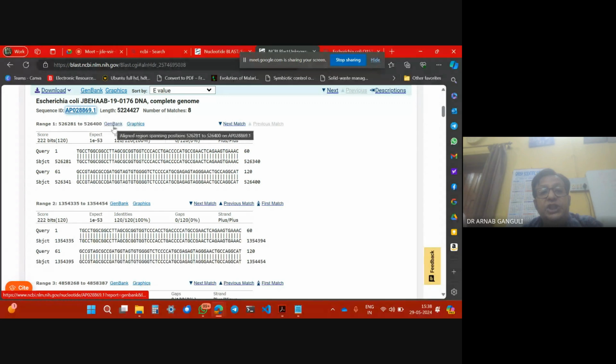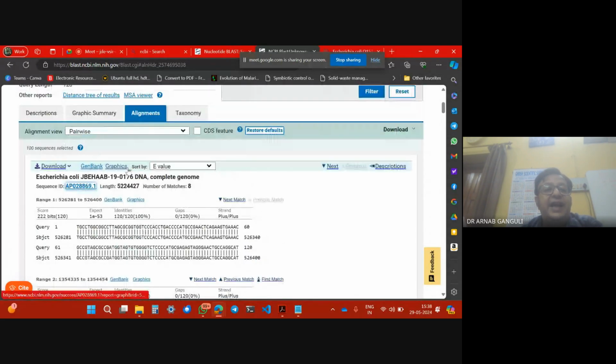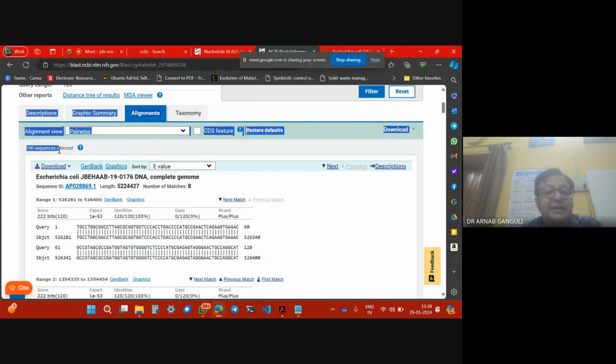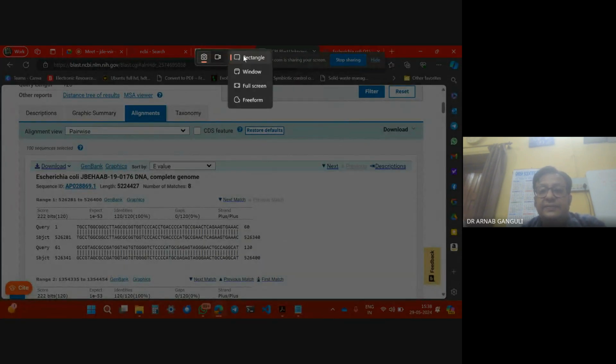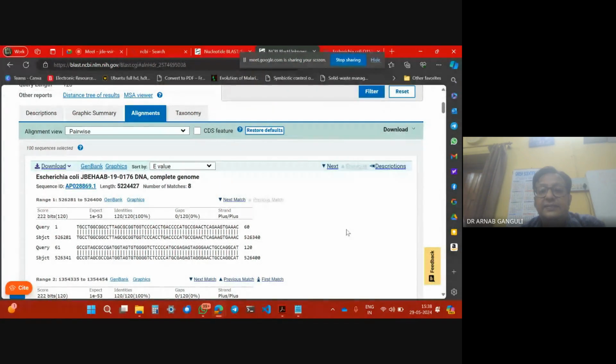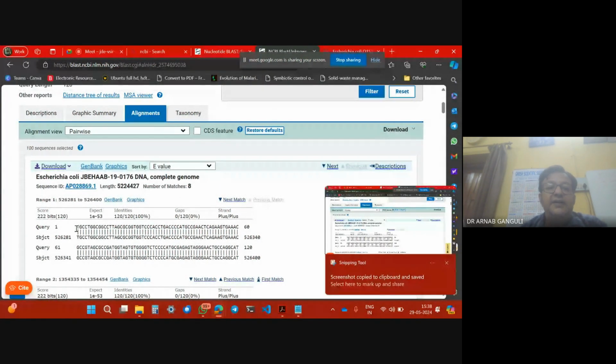अच्छा, यहाँ पे भी GenBank, you have got GenBank. You can have all this is DNA, whatever it is, and this type of alignment, एक के साथ एक का जो अलाइनमेंट होता है, this is known as pairwise alignment. Two sequences, one is your query sequence or the one you have selected.